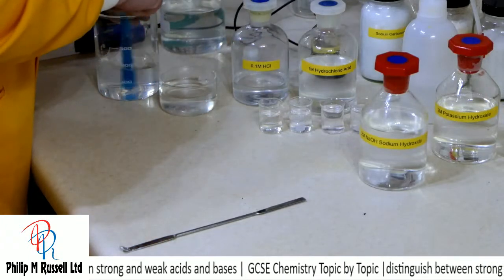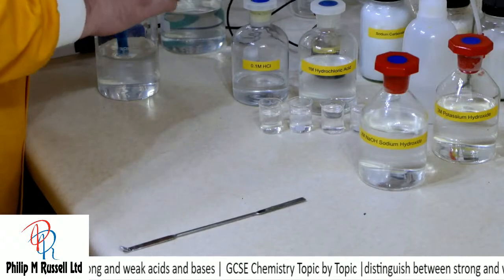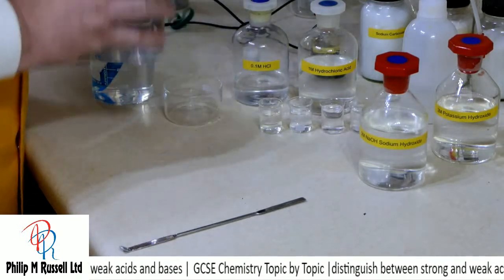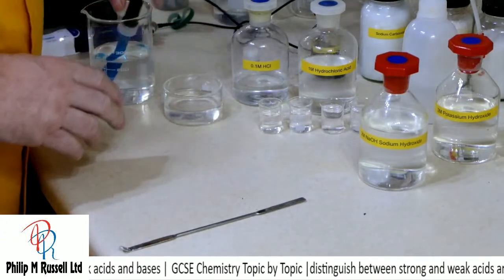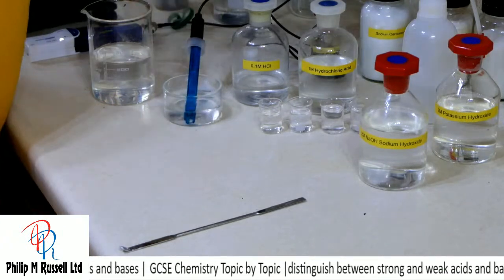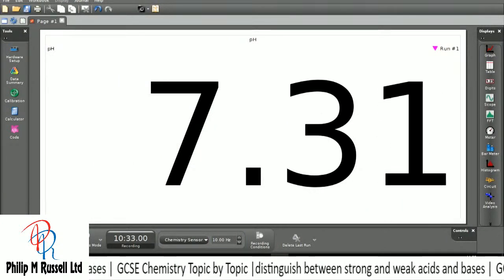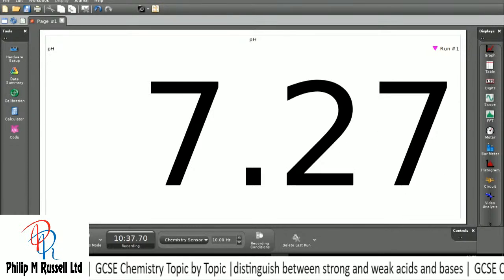Well, would sodium hydroxide be any different? Well, it probably would. So it's probably worth having a look at this. So I've cleaned my pH probe and it's down to about 7.3, probably going down to 7.1 again. So it's getting right.